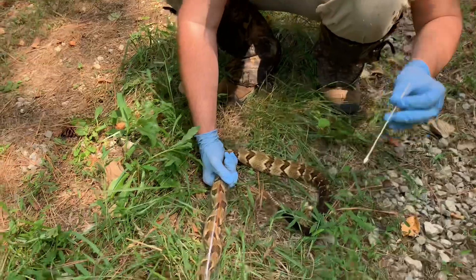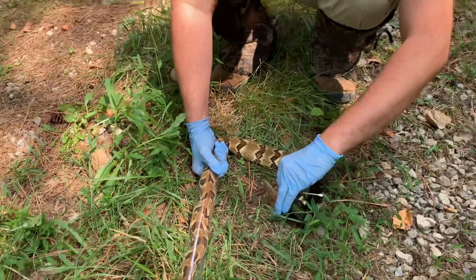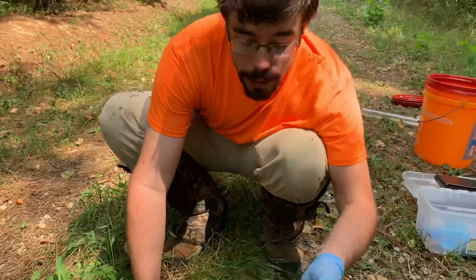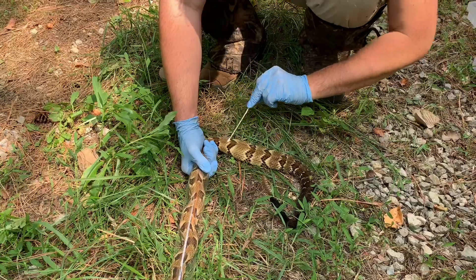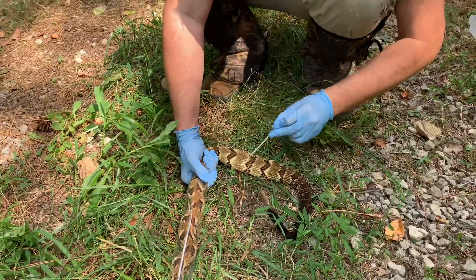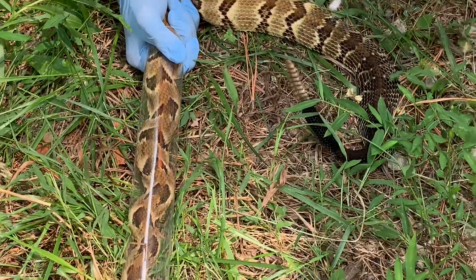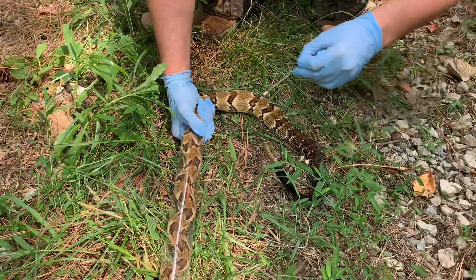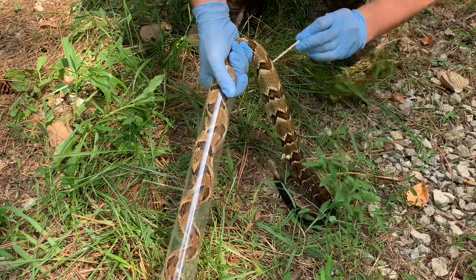Now we're going to take some of these swabs — if you can hear me over the rattle. Now we're going to take a few swabs on her body to see if, when we send this in, there's any hint of Ophidiomyces on the swabs. We're going to do five on the top and on the side and on the side, and then on the underbelly as well.